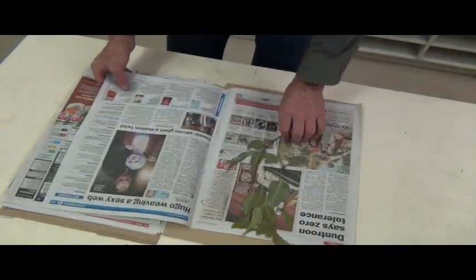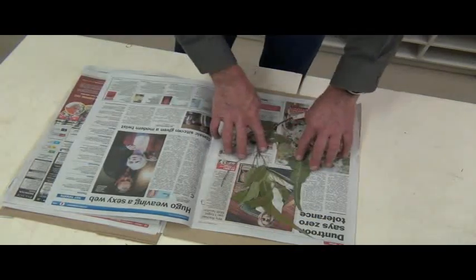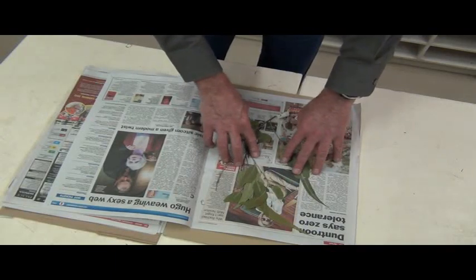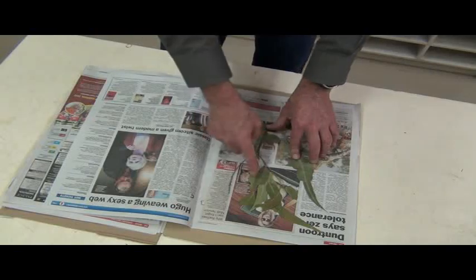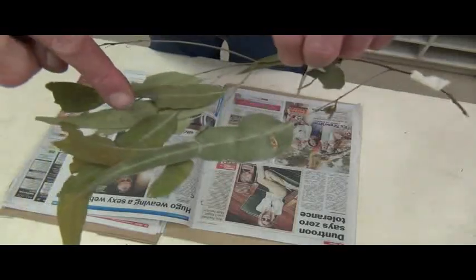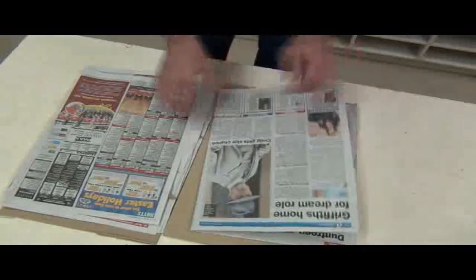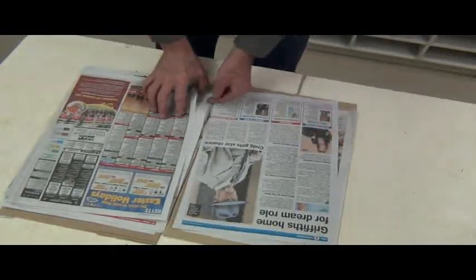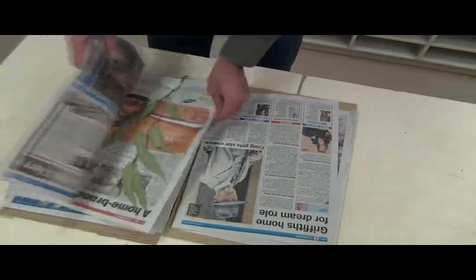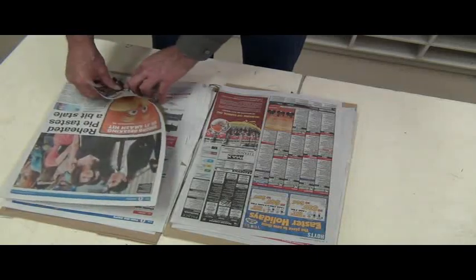If there's something more to that specimen it could be redeeming, but on its own, a bit more effort to spread that out at the time of pressing. It's good that there are leaves facing up and down. This is a nice example of a eucalypt where the leaves are discolourous, so it's really important to be able to see that. But obviously it's sterile, and we want to see fertile material.